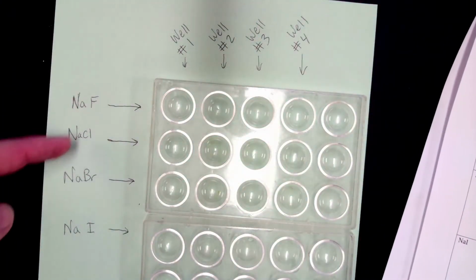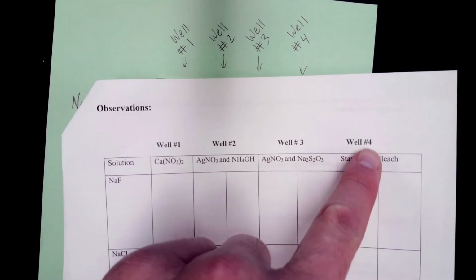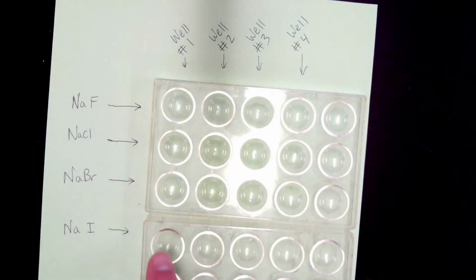So here's our 4x4 grid. I know I'm going fast, so pause this. We have the 4 halides. So halides are when they're mixed with a metal. And then we have 4 wells. So you see you got wells 1, 2, 3, 4. So we've got a nice 4x4 grid here with the well plates.